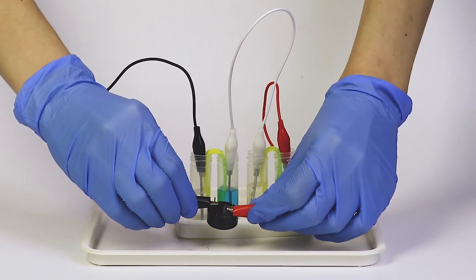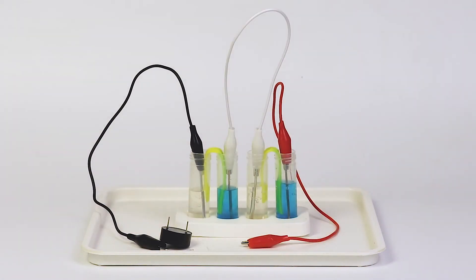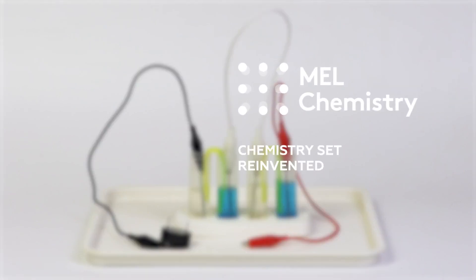As a result, a zinc rod is gradually oxidized and dissolved, while the copper piece is being reduced to yield metal copper that precipitates on its surface. Learn more about this experiment on our male science website.